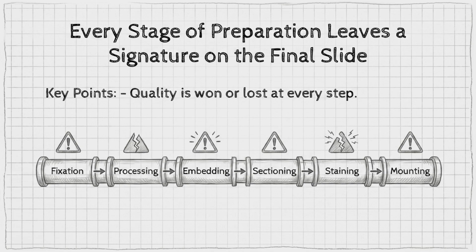Every step in preparing a slide leaves its mark, a signature that tells a story. From the moment tissue is collected to when it's mounted, each action impacts the final product. We'll explore how these signatures can be read. Understanding this helps you identify issues and prevent them. It's about recognizing the impact of your hands-on work. This leads us directly into how fixation, the very first step, sets the stage for everything else.